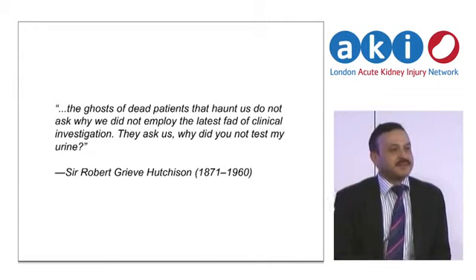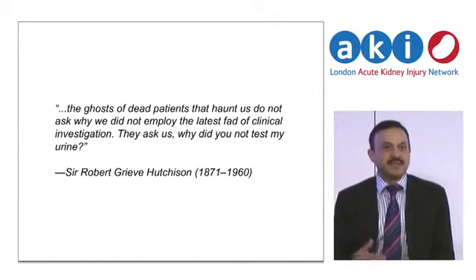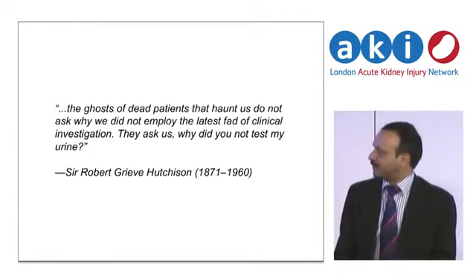So what I'll do is I'll talk about a few patients, very typical presentations of acute kidney injury, and go through basic steps in examining the urine for making an educated guess as to what is involved.